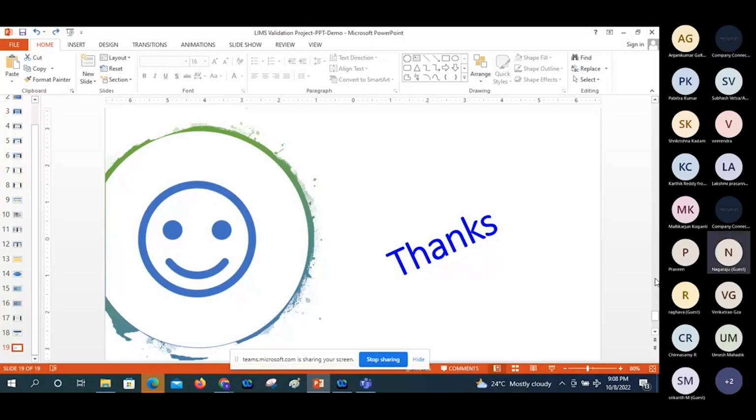Thank you. Sir, will we get any assignment to do, like creation of masters in LIMS and all, that kind of assignment? Assignment, see, I can explain how to do the master data creation. In between, if you have any doubts, how to create the analysis, how to create the product, I can explain thoroughly. No issue about that.